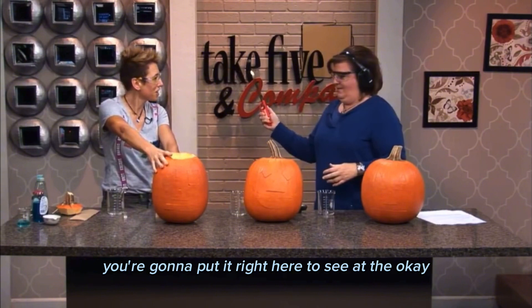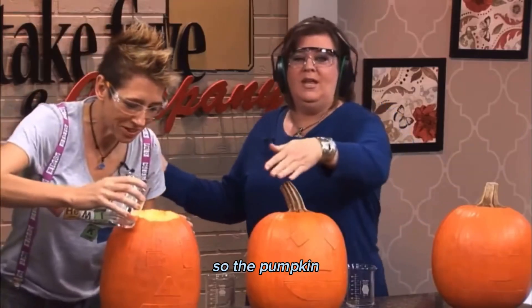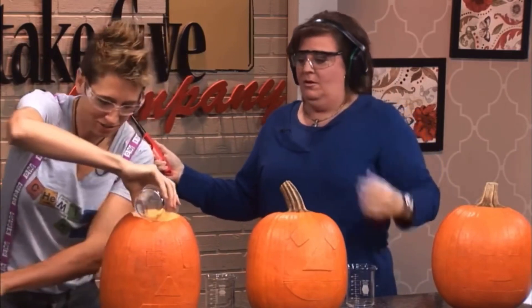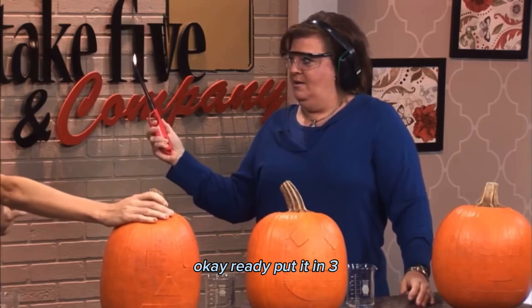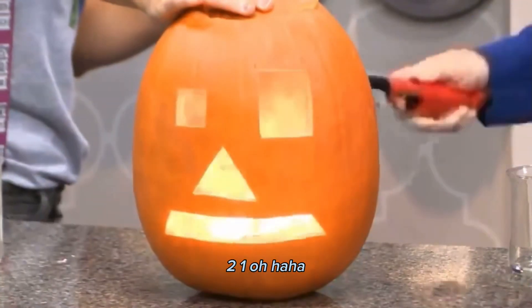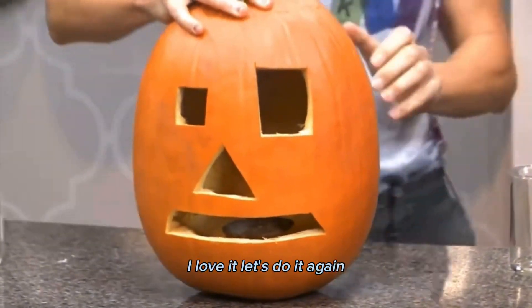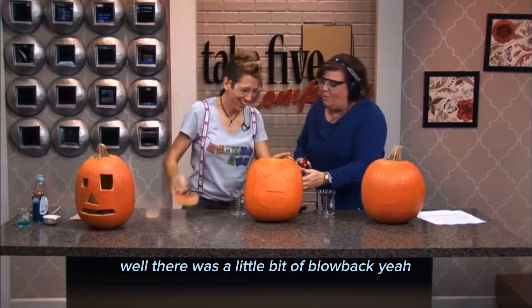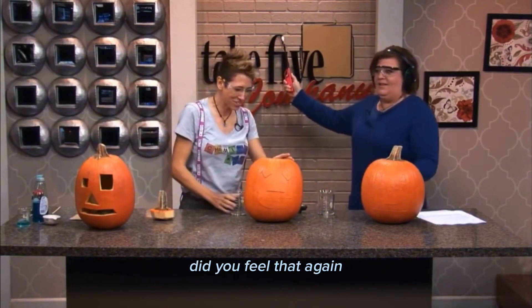I see it, yep. The pumpkin has the face already carved in it, but the pieces are not pulled out. Ready? Put it in. Three, two, one. Oh! I love it! Let's do it again! Do it again, Catherine? There was a little bit of blowback. Did you feel that? Yeah, I did. I'm terrified.